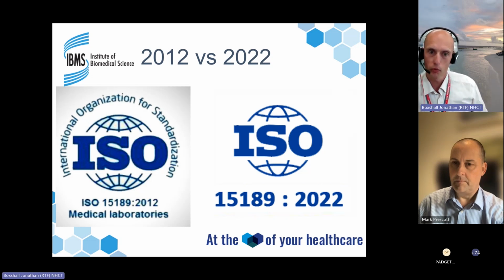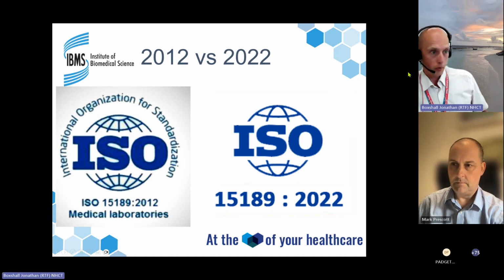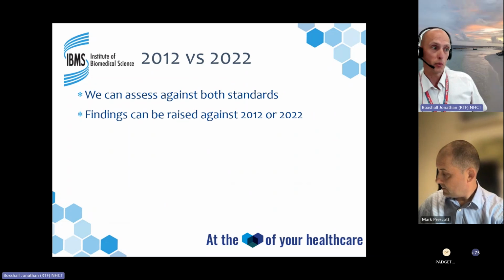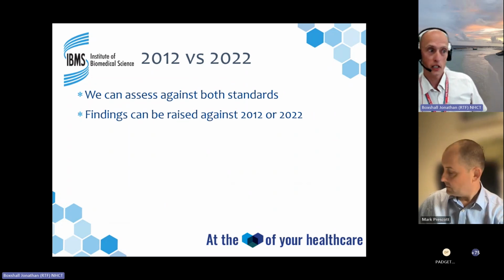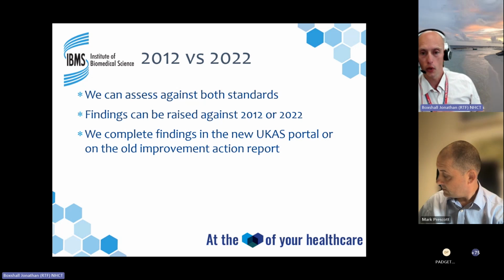2012? Yes, there may be a gap for 2022, which we will raise as part of transition, but we can still look at it to make sure that we're happy that you haven't fallen back with 2012 and are potentially putting your compliance at risk. And what we can do is effectively raise, as we used to, findings against either 2012 or 22. However, what we do is find the equivalent clause in the new 2022 standard. So you'll always get that.